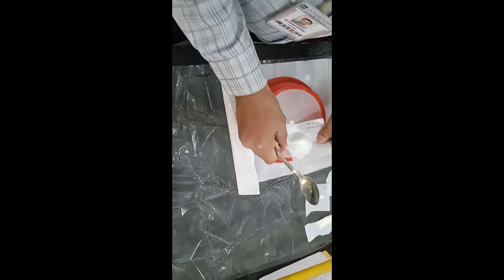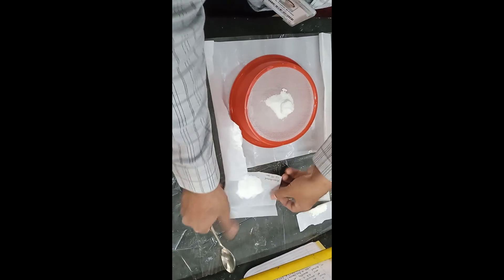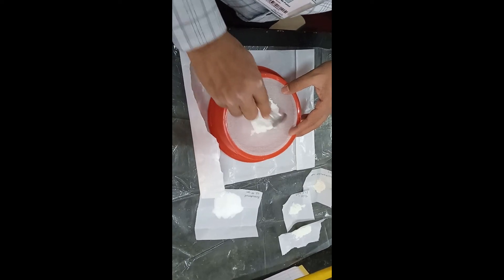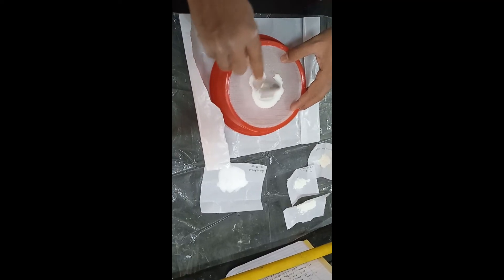The first step is sifting of the materials through a 40 mesh sieve, so that we can get the uniform particle size of all starting materials.